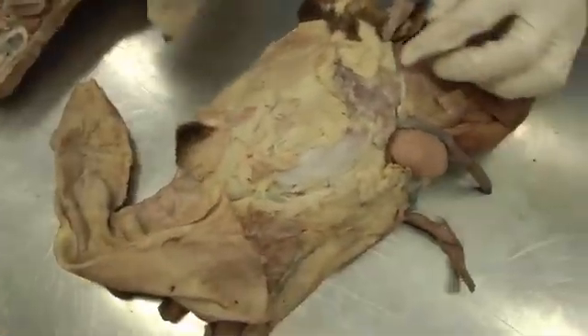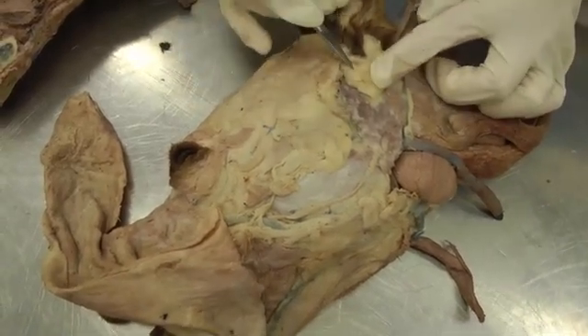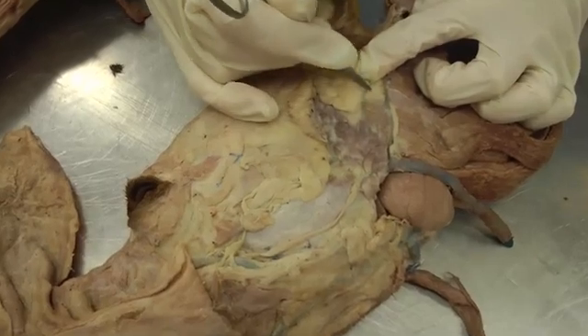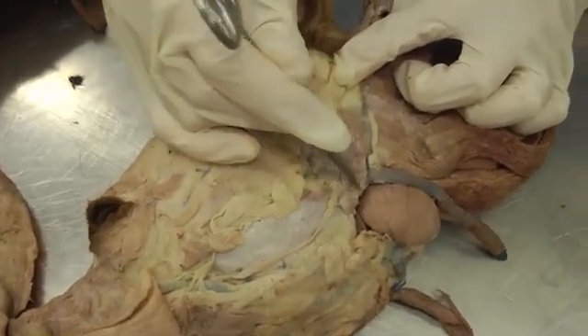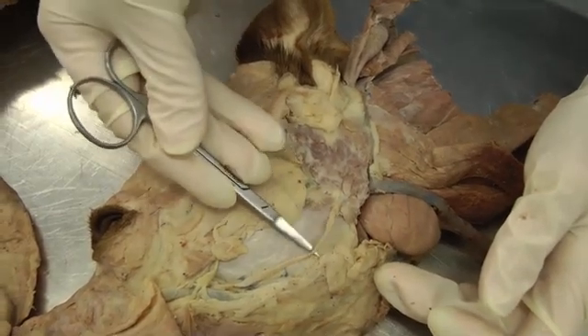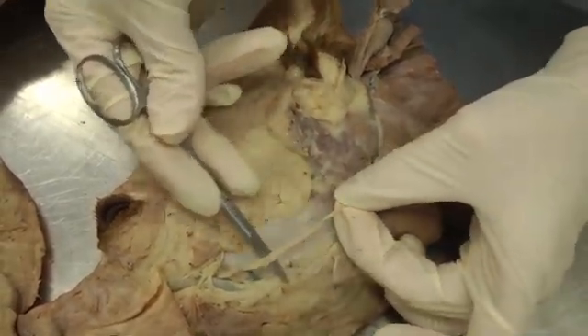Back to the lateral side: the parotid salivary gland makes a V shape around the base of the ear. The parotid salivary is right here, making that V shape. Then you have the parotid duct going across the masseter muscle across the cheek — right here is the parotid duct.